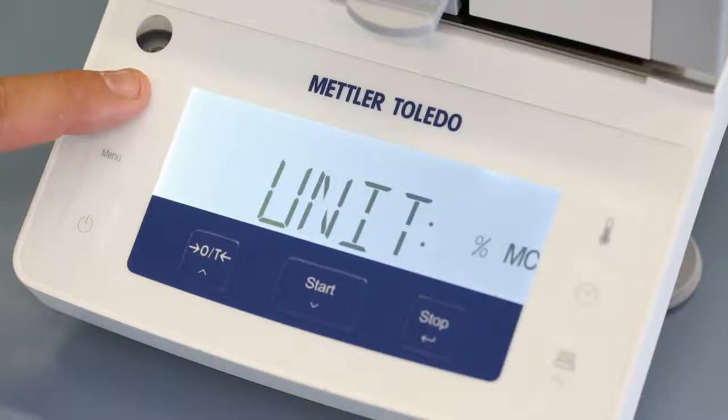Five different result units can be shown: percentage moisture content, percentage dry content, absolute moisture content, absolute dry content, and the weight loss in grams.